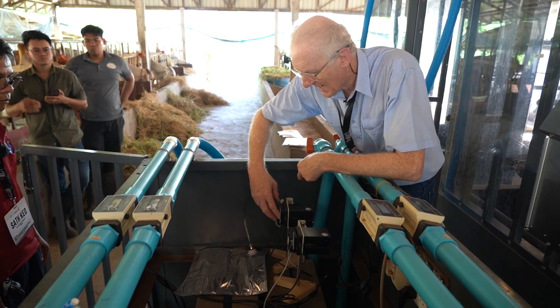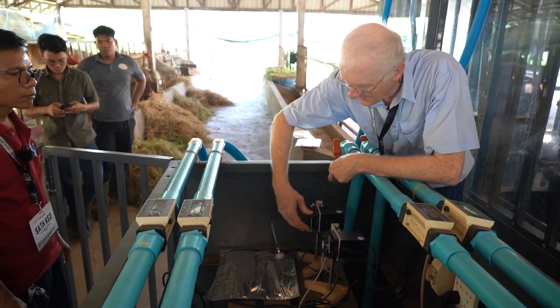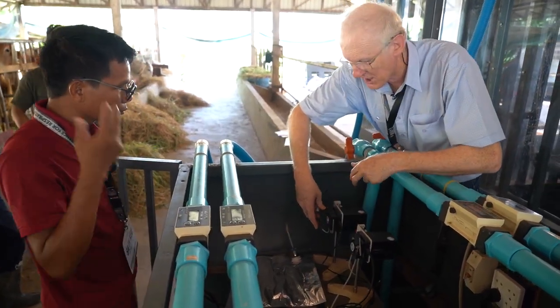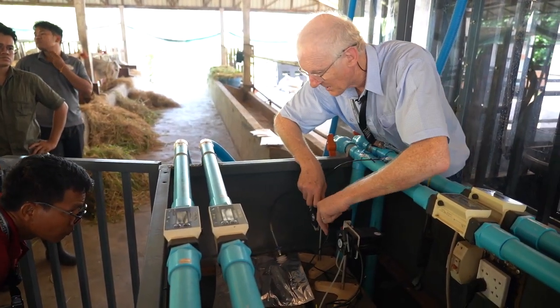And we can turn on this peristaltic pump. It might already be turning, I can't see, no it's not. So we lock it in, put the pressure on the system, and I would turn it on if I could.